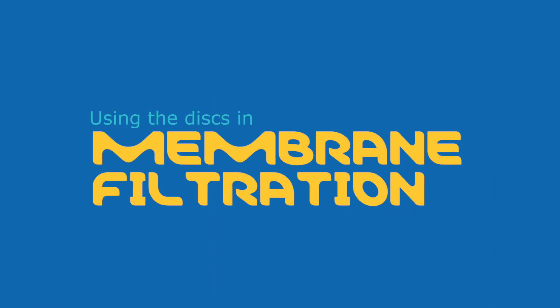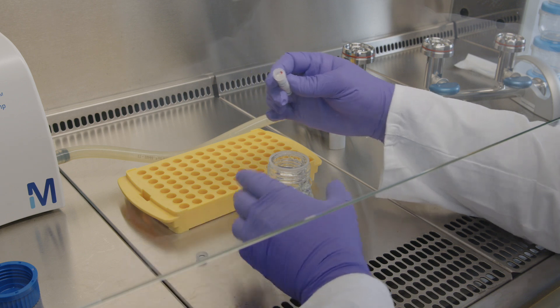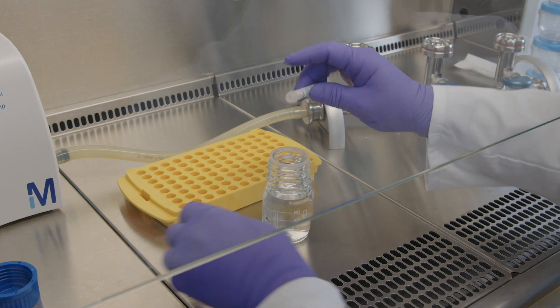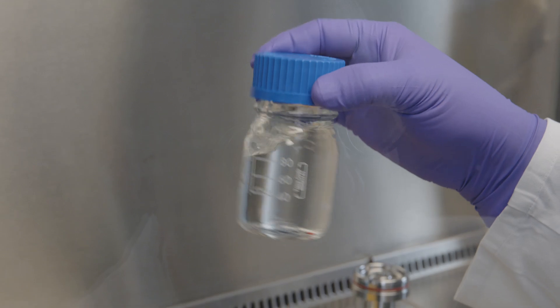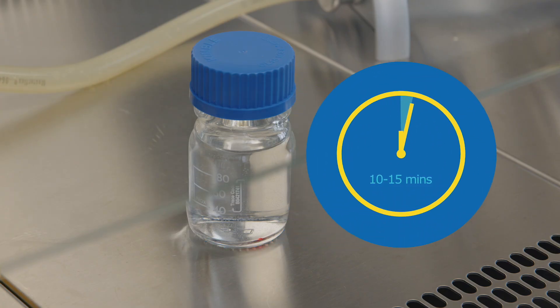If the discs are used in membrane filtration, they can be rehydrated in sterilized tap water, buffer, or dilution solvent. Never rehydrate in distilled water. Take a vial that has reached ambient temperature, open it, and drop the disc into the buffer, diluent, or sterilized tap water. Shake gently and leave the inoculated liquid at room temperature for 10 to 15 minutes.